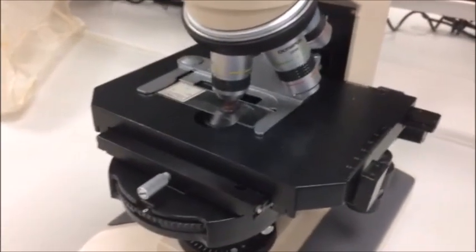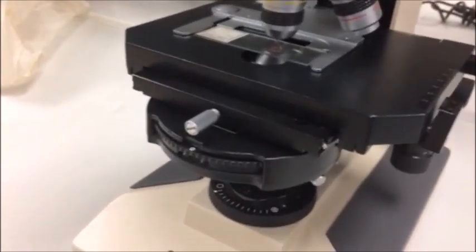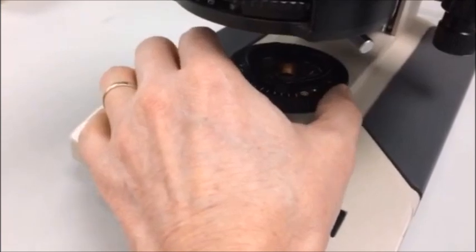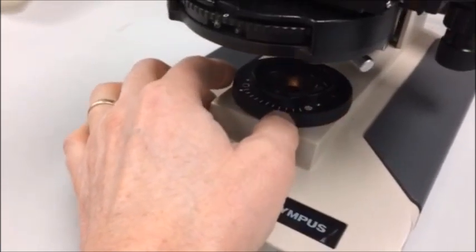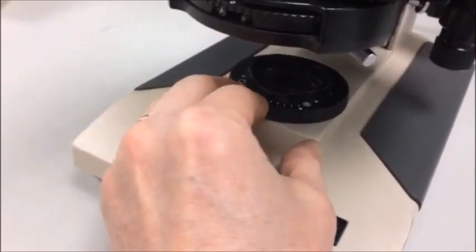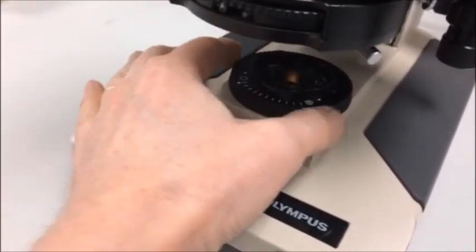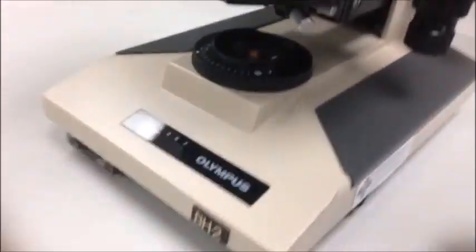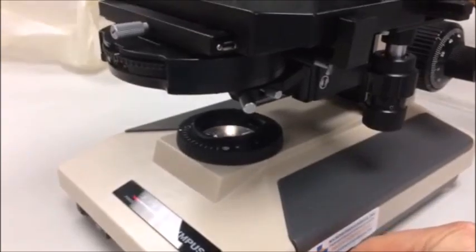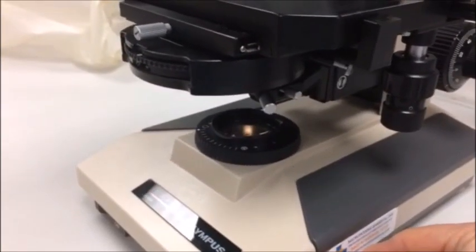The other part of the initial setup is to make sure that you actually have enough light that you can see what you're doing. And there's two ways to control this. One is by the field diaphragm adjustment dial, which is underneath here. If you turn it to the right, it's closed. We want it all the way over to the left so that it's open. And then there's also a rheostat down here that adjusts the brightness of the light. So if I slide it back and forth, the light gets brighter and dimmer.